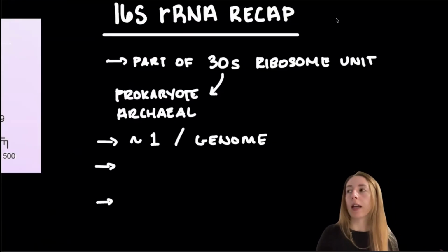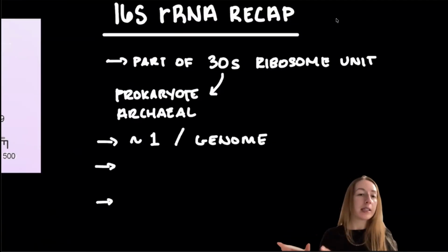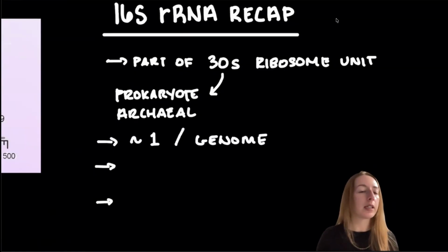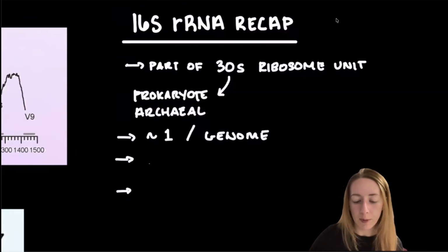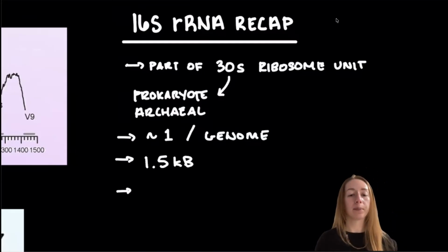This will allow us to get more or less a proportional representation of how many of each microbe there were. However, we're not really going to get absolute counts. In the end, when we analyze our data, what we're really analyzing is not absolutely how many microbes there were in our sample. We're going to be looking at more of a proportion or composition, right? Especially because we amplified with PCR.